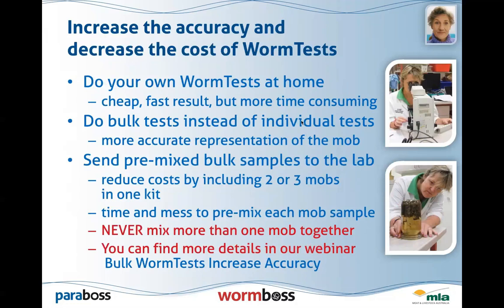So I think it's worthwhile contacting your local lab and getting some tests done through them. But if you do it at home, it certainly will reduce your cost and you don't have to wait very long for results. Doing bulk tests also will increase the accuracy of your tests and therefore it increases the value of them.